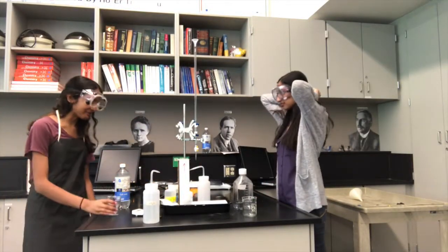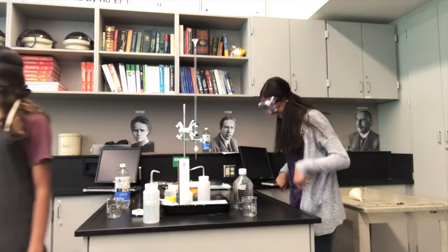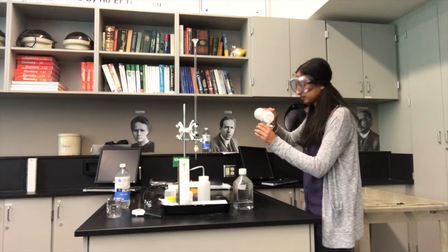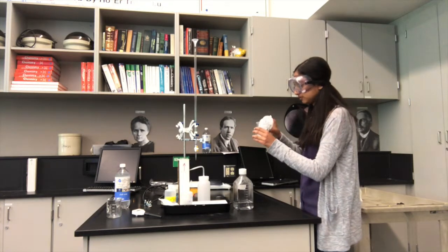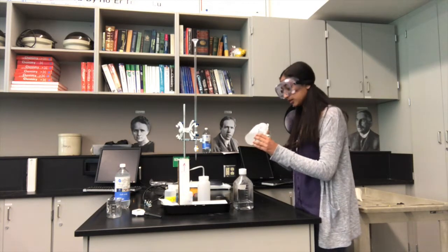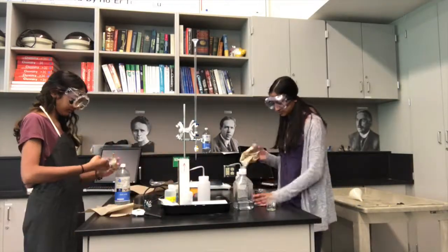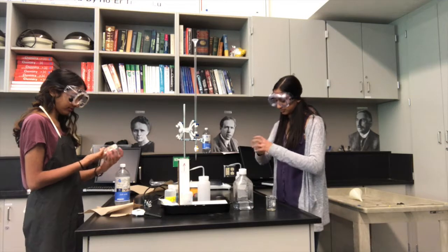Wear the appropriate lab attire before beginning the lab. Rinse all glassware with distilled water to remove any leftover chemicals. Dry beakers to remove any excess water.